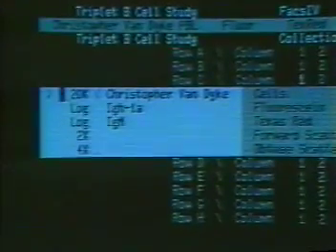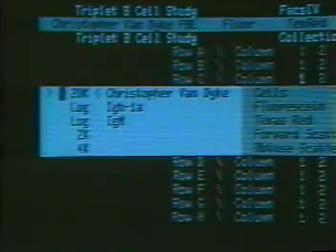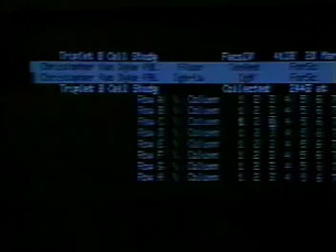When the collection is complete, Tom moves the cursor to his next sample, C3, and again hits execute to view its label. Tom first checks the cell and stain labels for accuracy, then presses execute to start collection. Watch again as the sample label disappears and its information is transferred onto a new gray analysis line. Since the cells in this sample have been stained, the staining reagent is listed on the gray line in place of the fluorochrome with which it is associated.